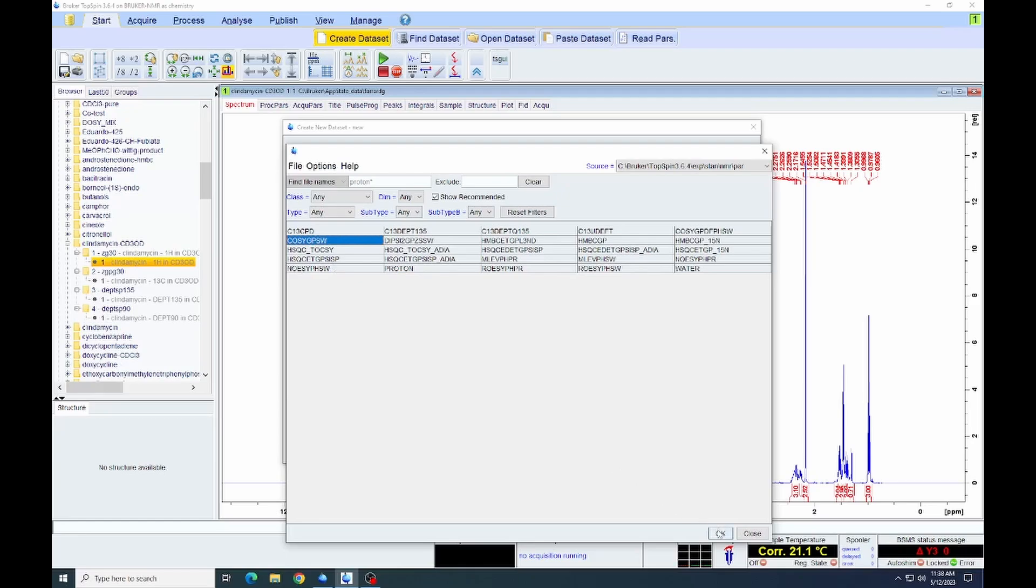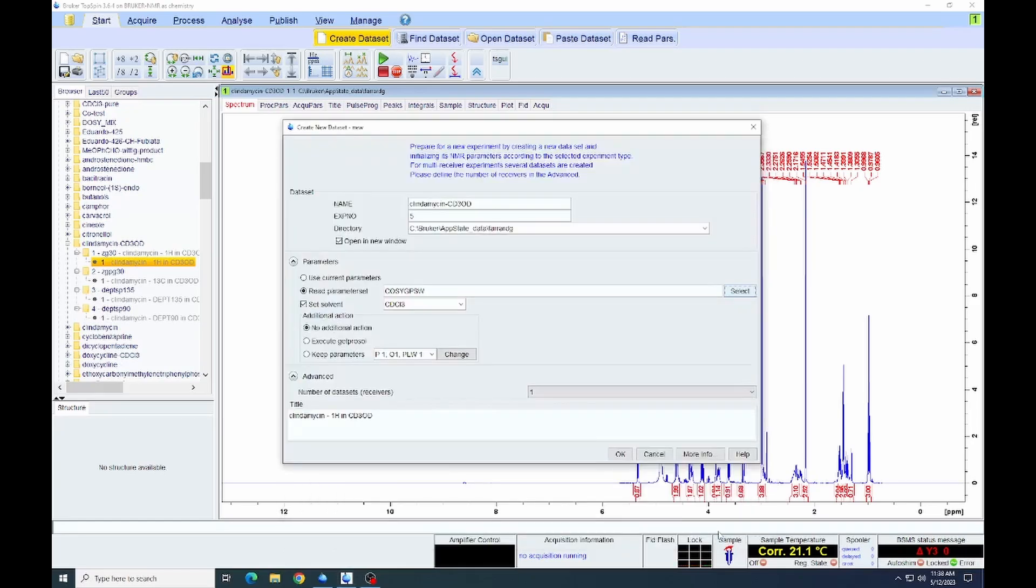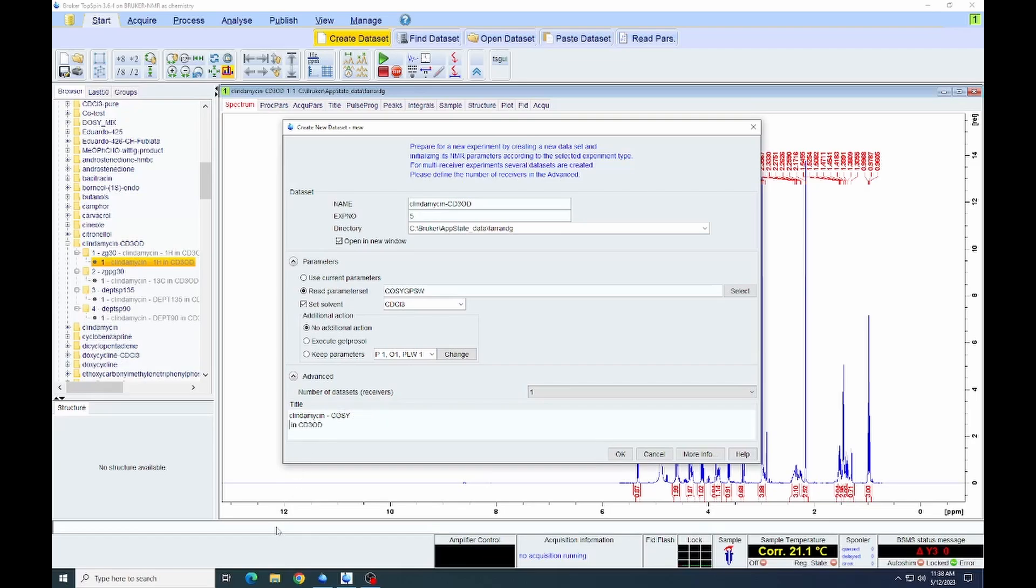This is a basic gradient COSY spectrum. After selecting that, we can then click OK and then update the title to reflect the fact that we are now acquiring a COSY spectrum.